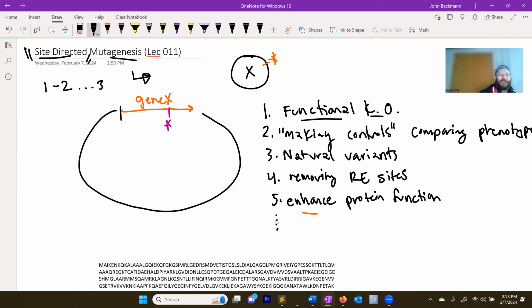The purpose of site-directed mutagenesis is typically to change a codon. And that's just enough subtlety that your primers will still bind perfectly fine, especially because these are actually long primers, so like 40 base pair primers. Good question.